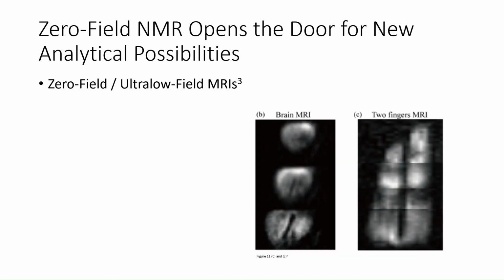A new way we can tackle MRI instruments in hospitals is by using zero-field NMR. MRI and NMR are the same instrument, and so using zero field can make MRIs accessible to people who may need the imaging but can't access the healthcare that they need. Some patients have pacemakers or metal joints or metal plating, and as an MRI is a large magnet, they can't use it. MRIs face some of the difficulties of high-field NMR in that the instrument is expensive and immobile.